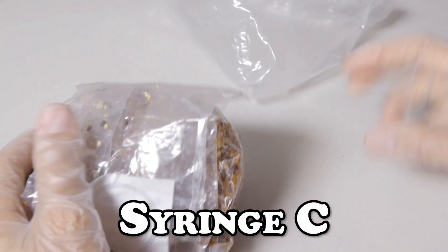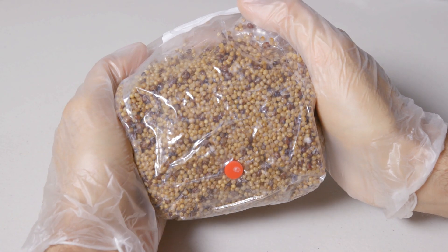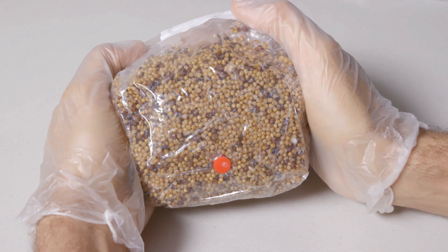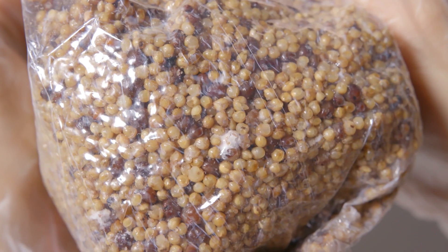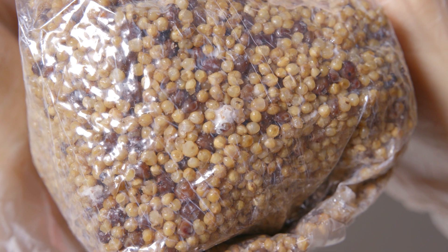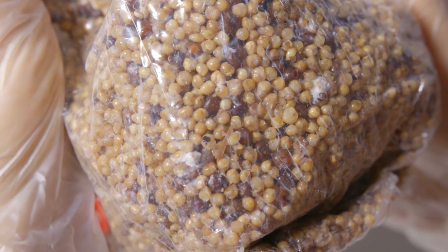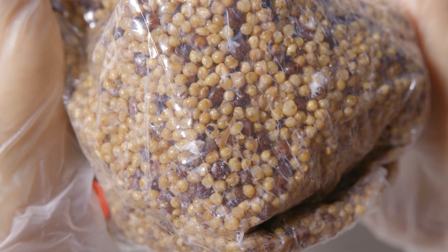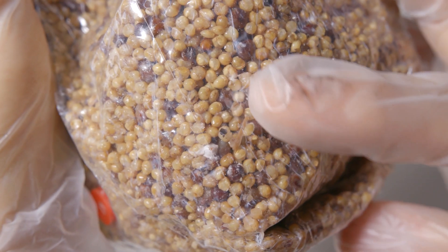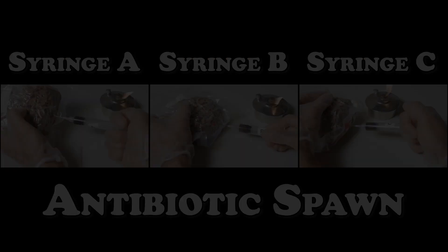Finally bag C. We do notice that there are some spots of that wispy mycelium dispersed throughout the grain, but not a whole lot of activity happening here. As we get a close up we can see the individual grains beginning to essentially melt against the bag as the bacteria begins to break it down. Let's now move on to our next test where we use the same syringes to inoculate grain bags treated with an antibiotic.